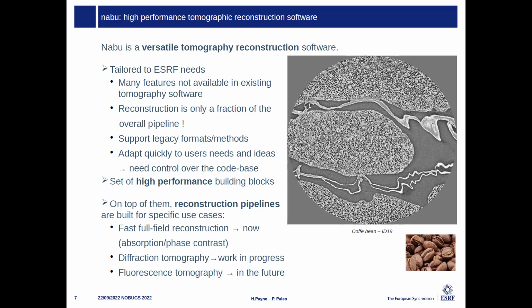And NABU is clearly targeting high-speed processing and having something very modular in order to create different pipelines. So it has been clearly tailored to ESRF needs. This is why we didn't take an existing solution. There are many features which were not available somewhere else.